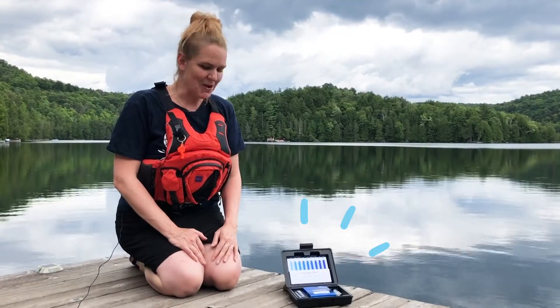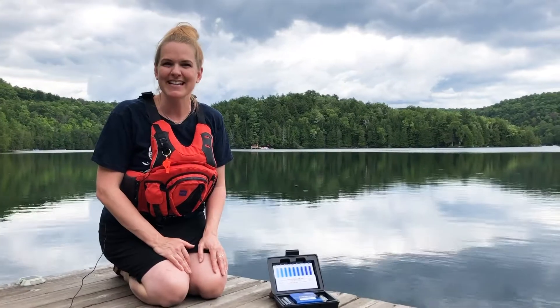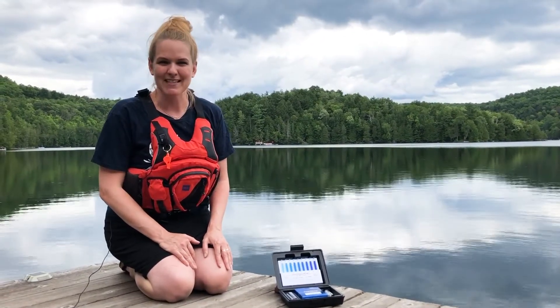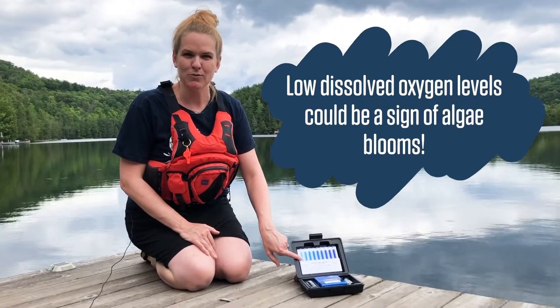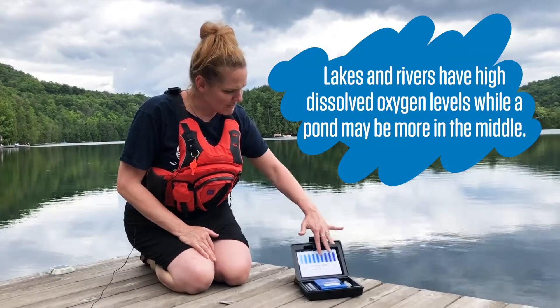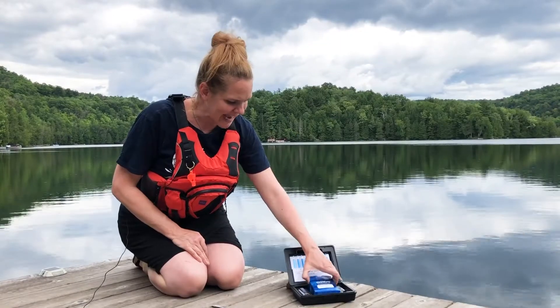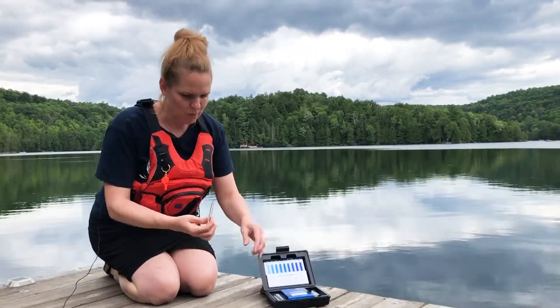We're going to be learning about dissolved oxygen and how to do this test. Oxygen is really important — it's how fish breathe underwater. In places like harbors where we have things like sewage overflows, we can have really low dissolved oxygen, which means the fish can't breathe. In lakes and rivers we expect values in the high range, between 7 and 12.